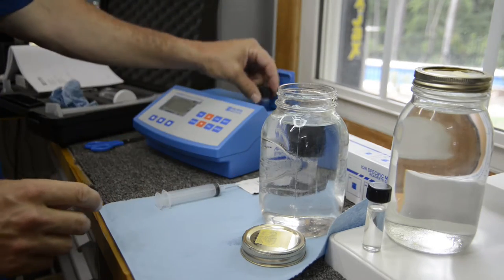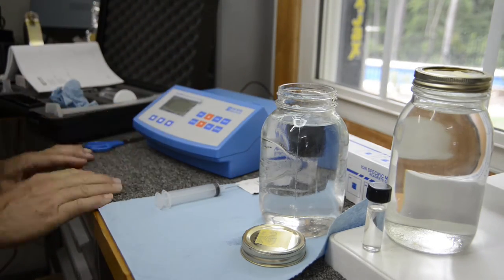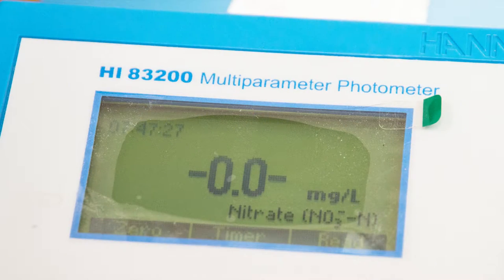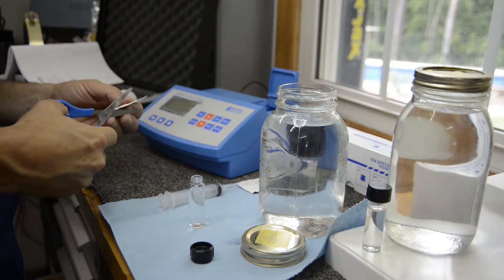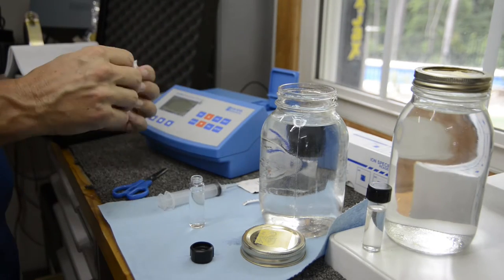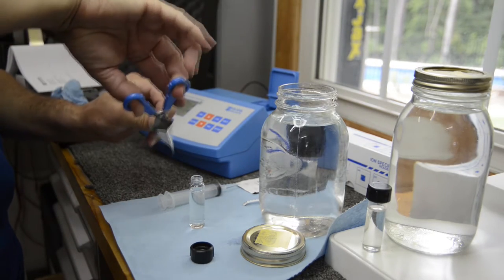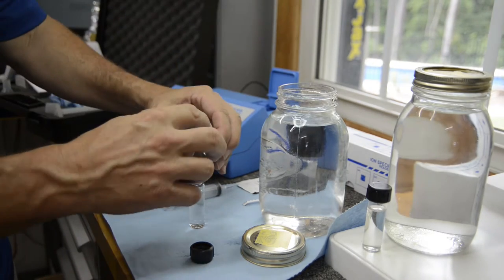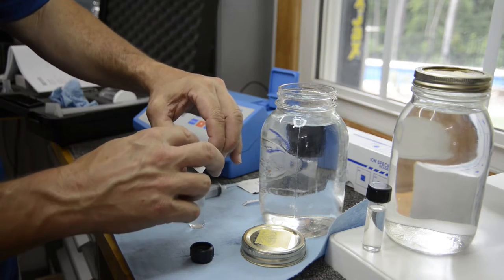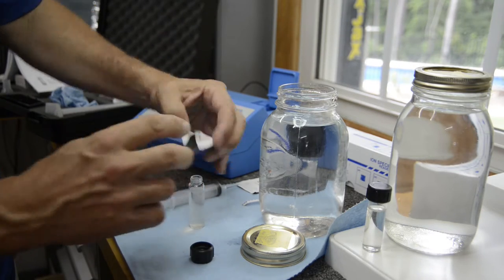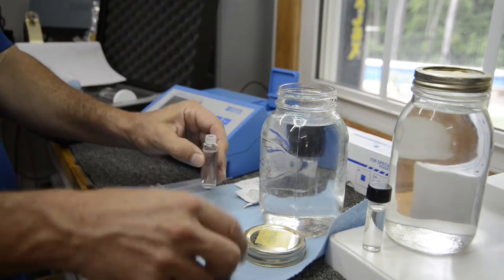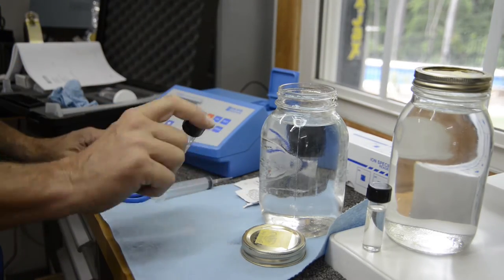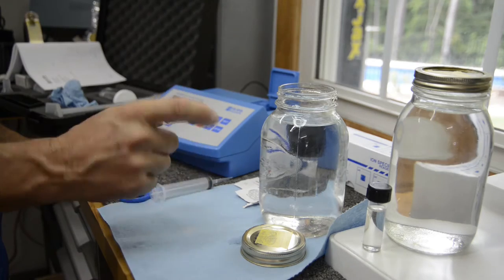We are going to speed this up. This is now the bubbled water, and we're going to zero our meter with the bubbled water. We'll add the reagent and make sure that we get it all in there. Put the lid on, rock it back and forth - about 10 times is usually sufficient.